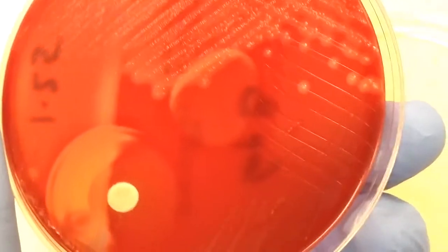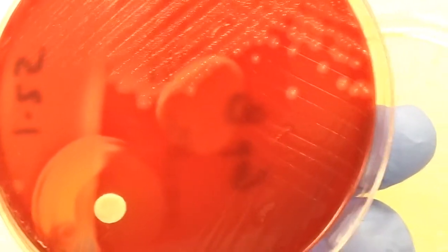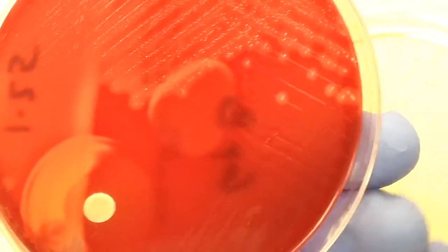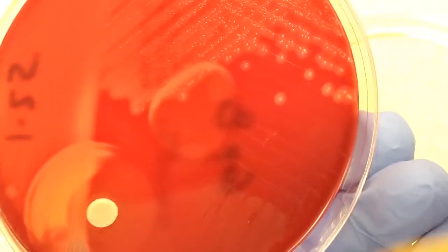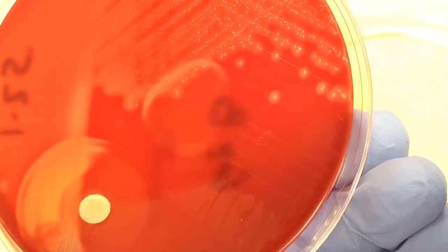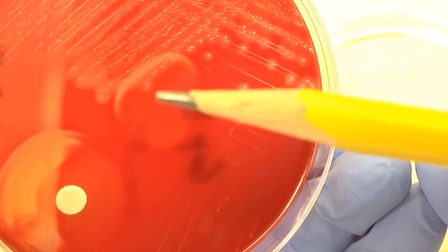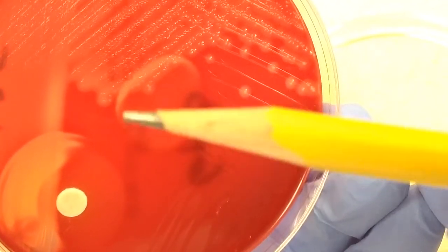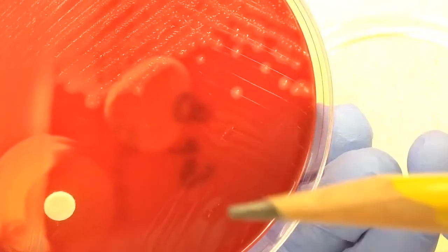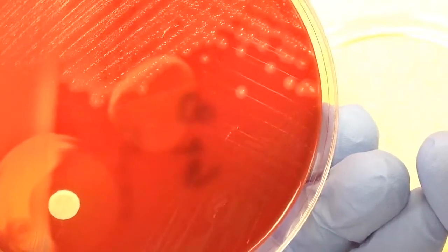So this plate has been able to incubate for between 24 and 48 hours, and you can see this enhanced zone of hemolysis where the disk is, and also where the reagent, the CAMP reagent that I put on. So this would be interpreted as a positive CAMP test.